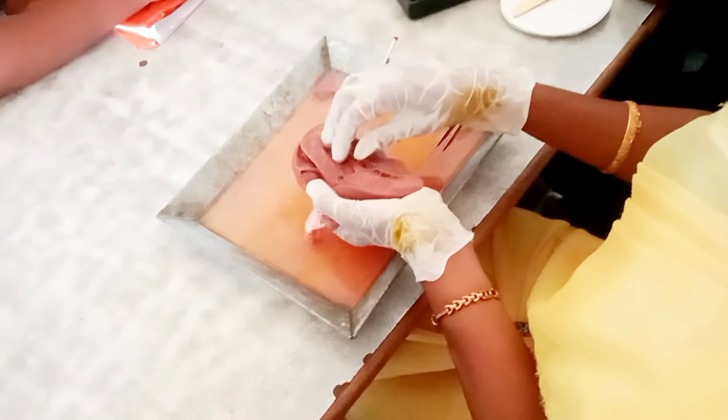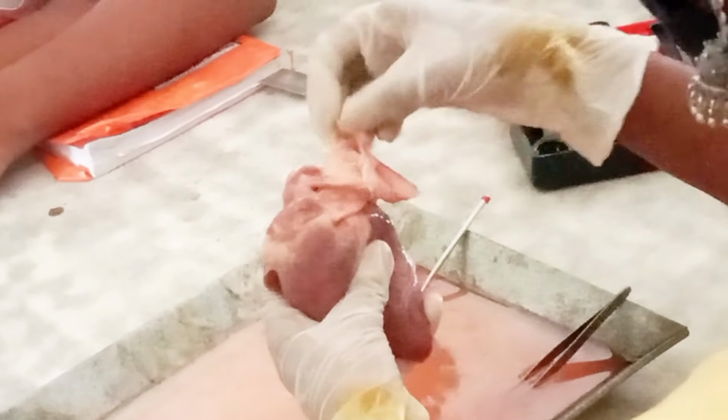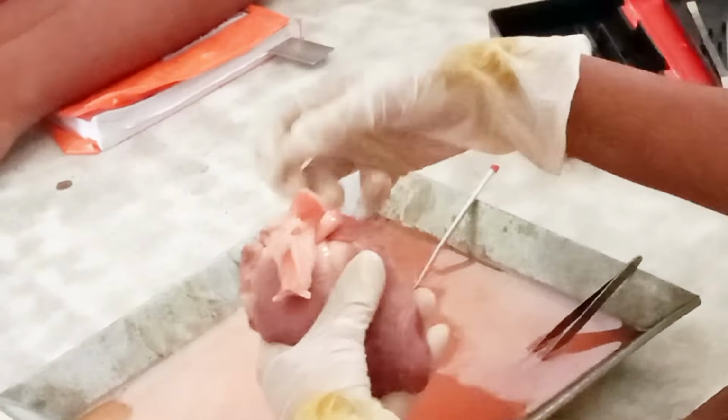You can see here is a way from auricles to ventricles to receive the blood. So, when these two auricles contract, blood gets into ventricles. Later, when ventricles contract, blood is pumped out to all the body parts. This is the structure and function of the heart. Hope you understand very well.